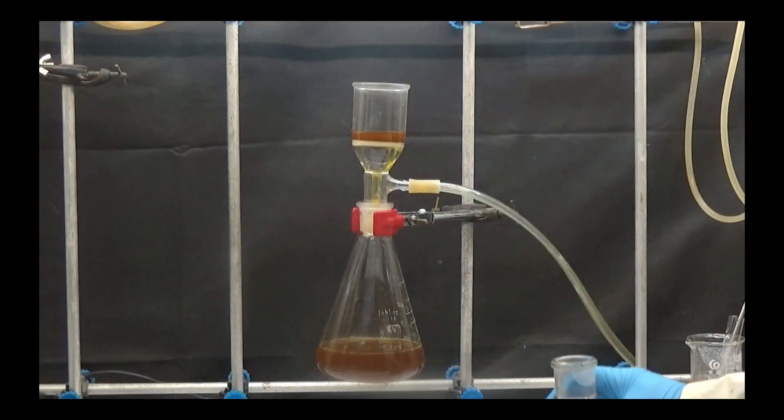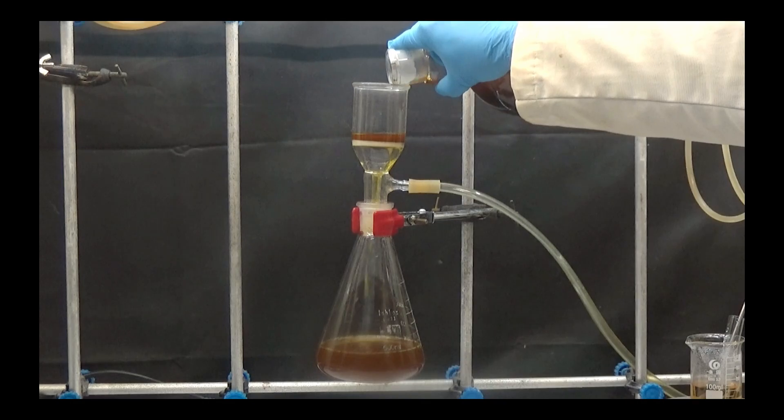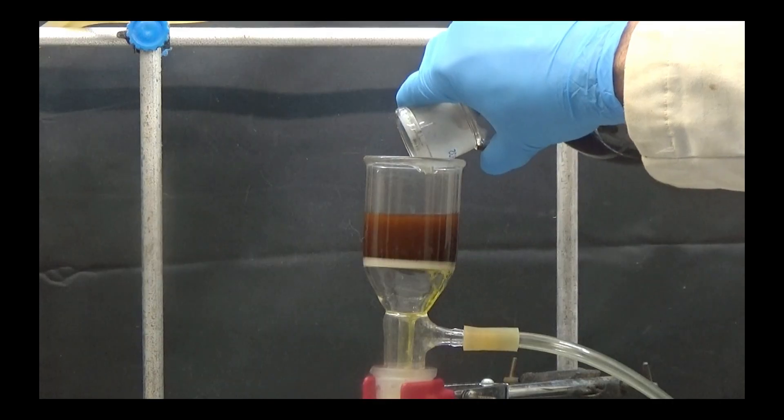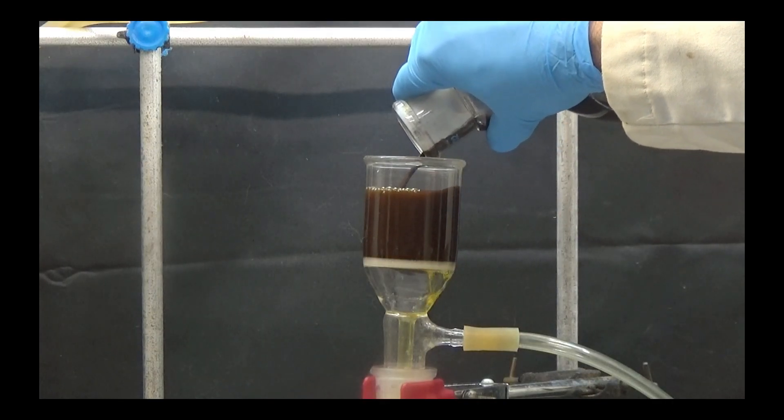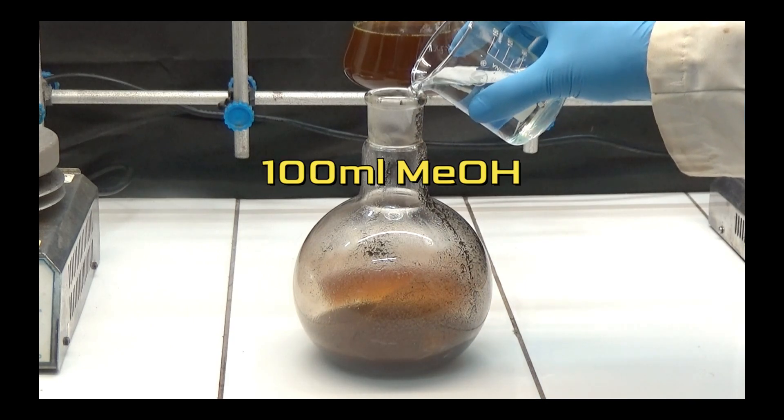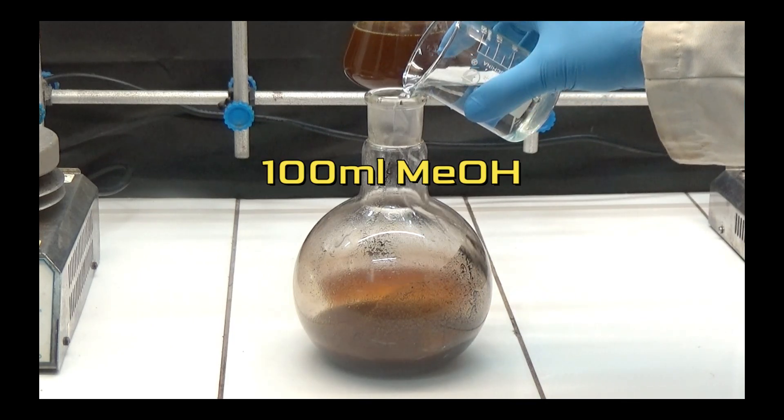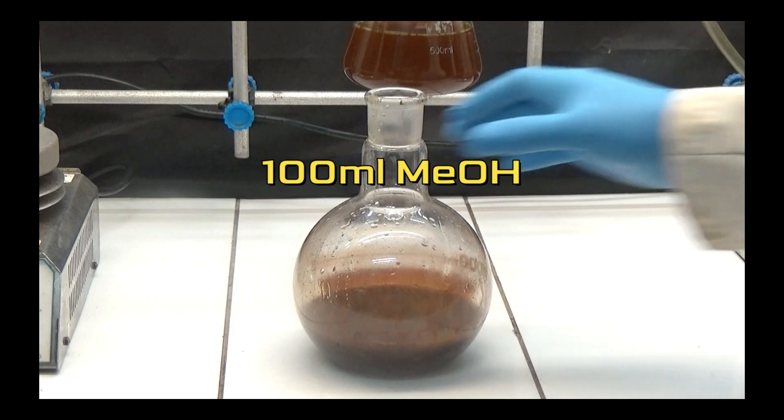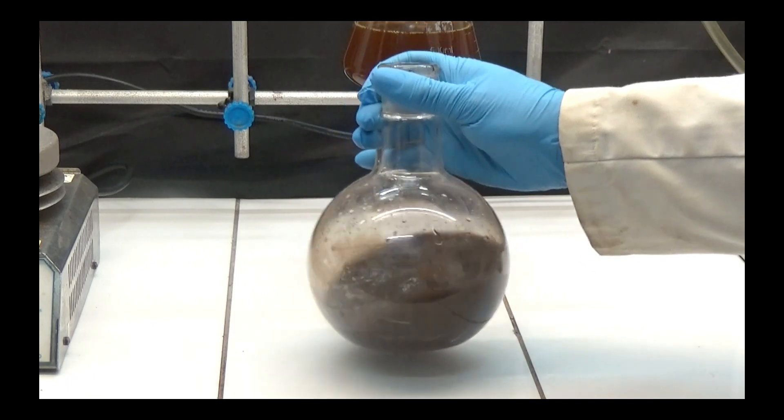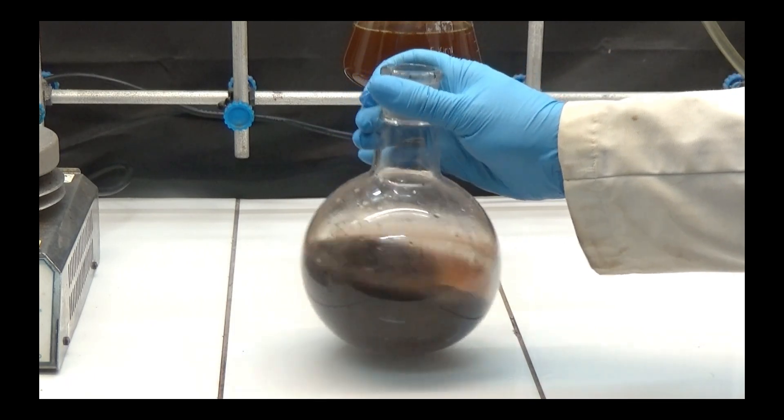Allow it to cool and separate the insoluble iron through filtration. Clean the iron powder using 100 milliliters of methanol. Iron is pyrophoric when dry, so it needs to be kept moist and disposed of properly.